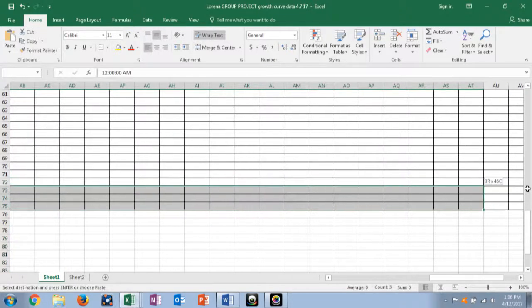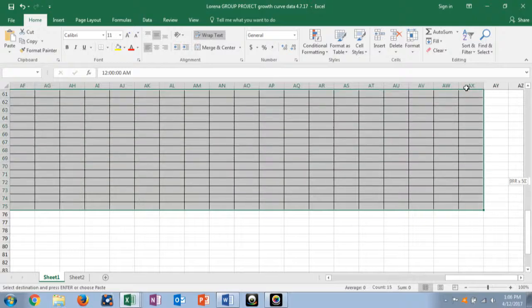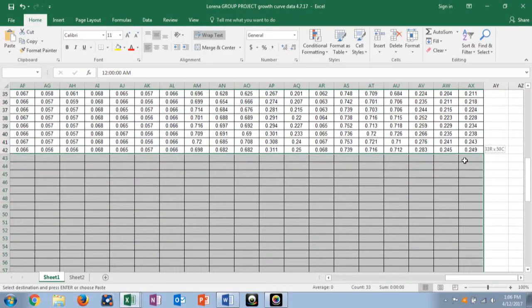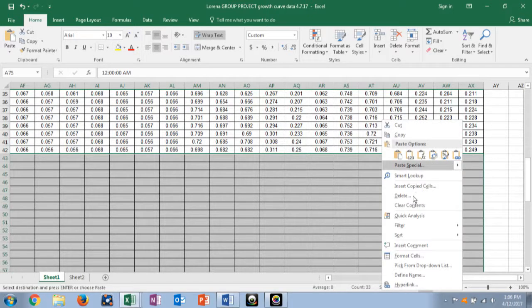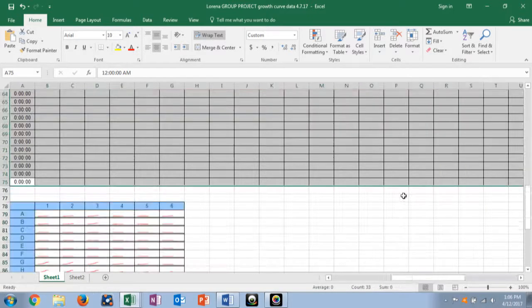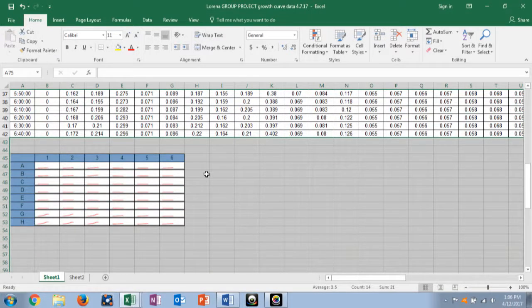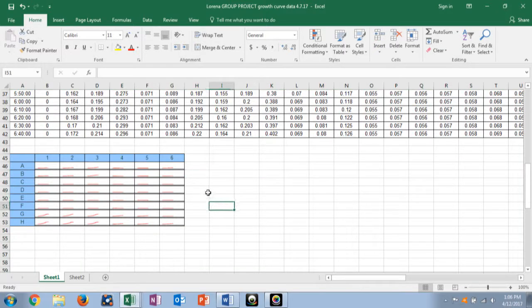Lorena's group, it's here. You have it. Yay. I'm just going to delete this from your data. Delete. Shift cells up. I'm going to save this for the time being.